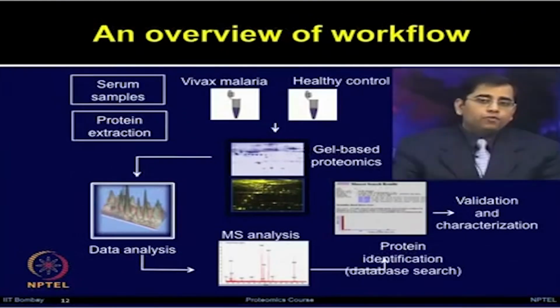This slide gives an overview of the workflow which we followed to investigate the host response against Plasmodium vivax in human serum. Serum samples were obtained, proteins were extracted, and the protein samples from healthy individuals and vivax patients were compared by applying gel based proteomics, including 2-dimensional electrophoresis and difference in gel electrophoresis.